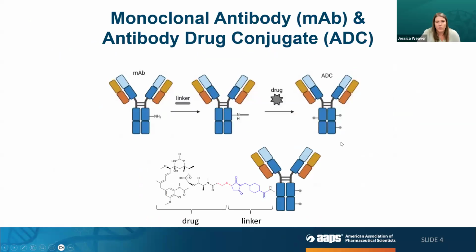Just a little background, as we all know, monoclonal antibodies are the backbone for antibody-drug conjugates. So for most monoclonal antibodies, a lot of the testing that we can do to support those is also carried over into ADCs. And the main primary difference is obviously the drug attached with the linker to make that monoclonal antibody now an ADC.